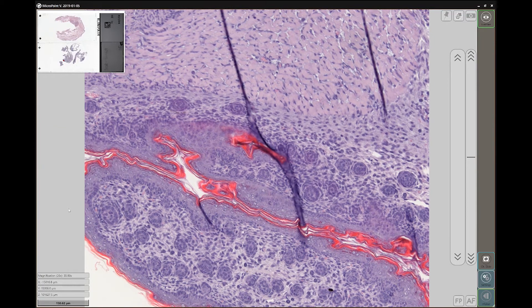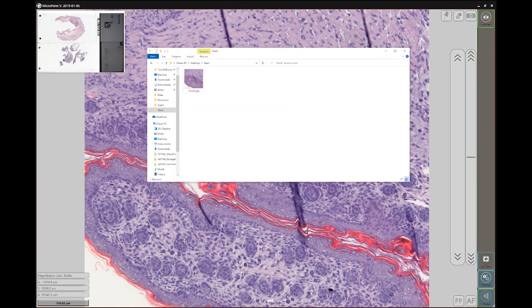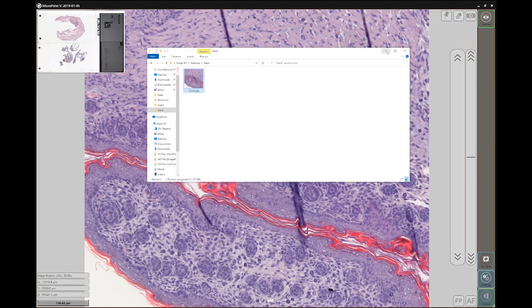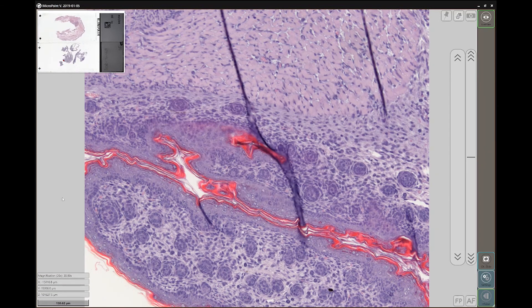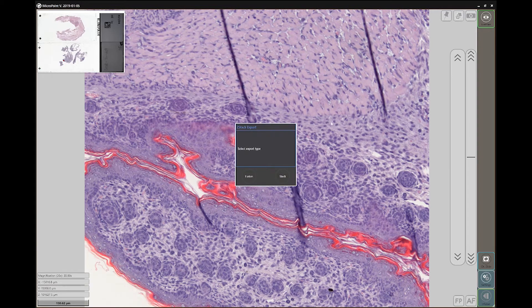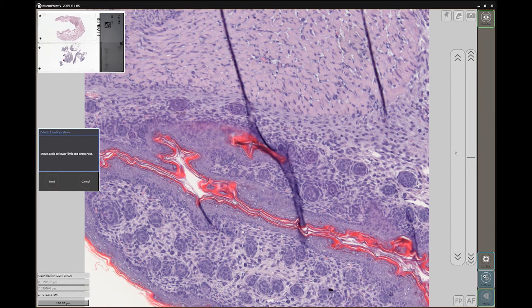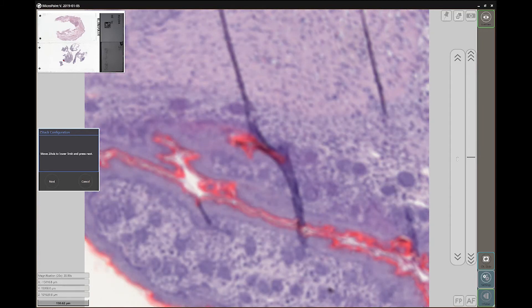Let's see the file — there is our fused image. To capture multiple pictures of the Z positions, we will follow the same process but we will now select the Stack export type.